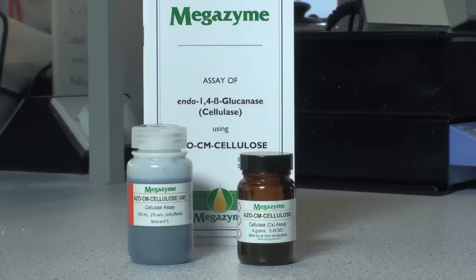The substrate employed is partially depolymerized and dyed CM cellulose 4M. The polysaccharide is dyed with Remazol Brilliant Blue R to an extent of approximately 1 dye molecule per 20 sugar residues.